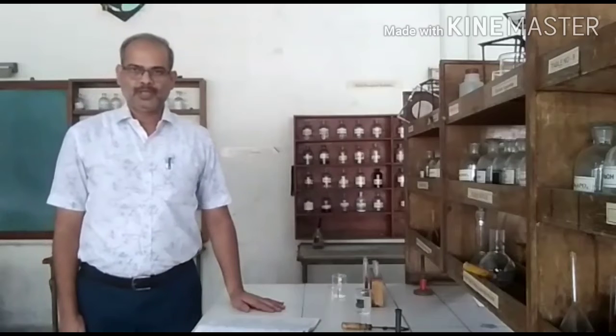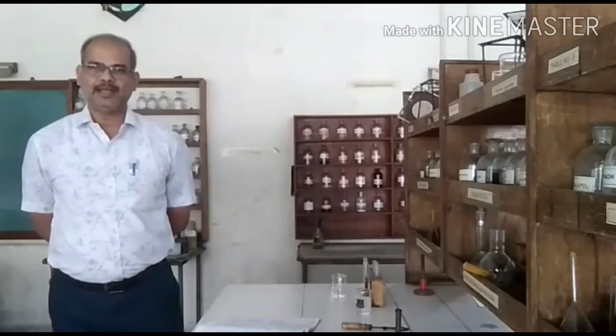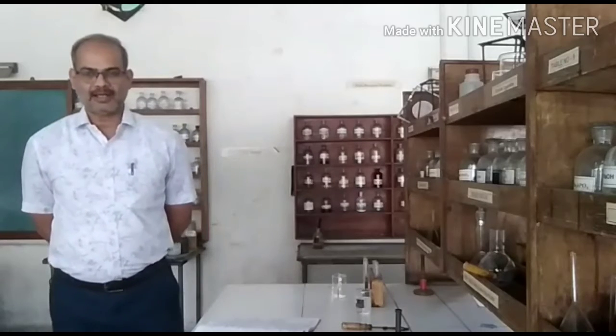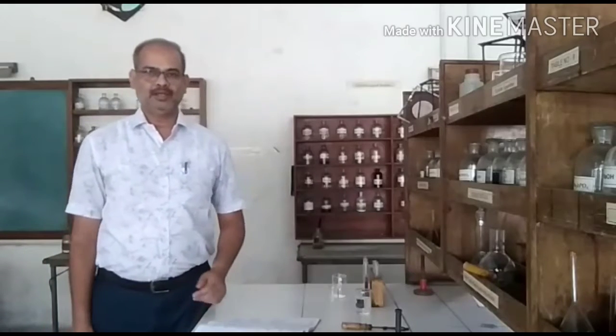In the first video I explained and demonstrated how to carry out the preliminary test and dry tests. In the second video I explained and demonstrated the next two steps, that is preparation of original solution OS and detection of the two acidic radicals by conducting the wet tests of anions. In the last video, we got two anions or acidic radicals. The first one was CO3-2 and the second one was SO4-2.